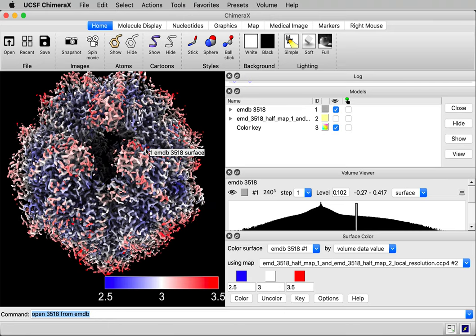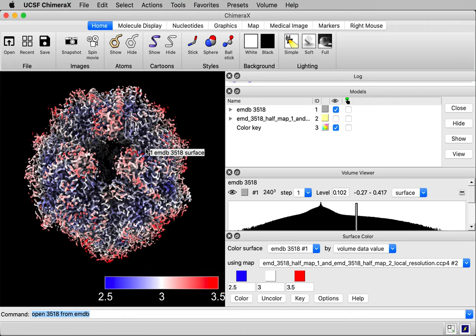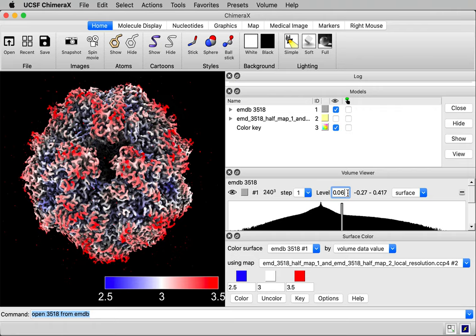And one other thing, the recommended contour level is a little bit lower for this map. I saw this on the EMDB website. It recommended 0.06 as the contour level. It said that was at 2.5 standard deviations.